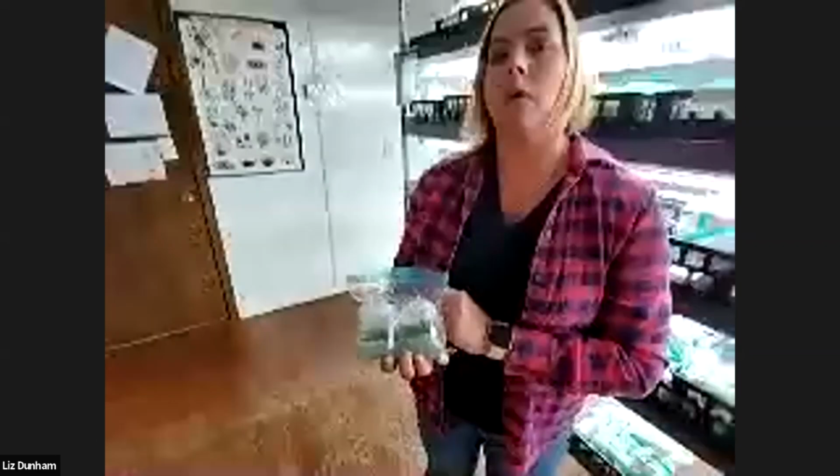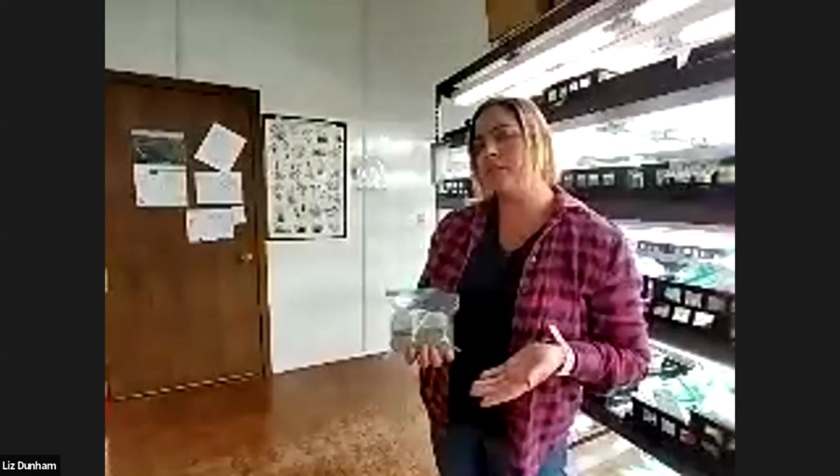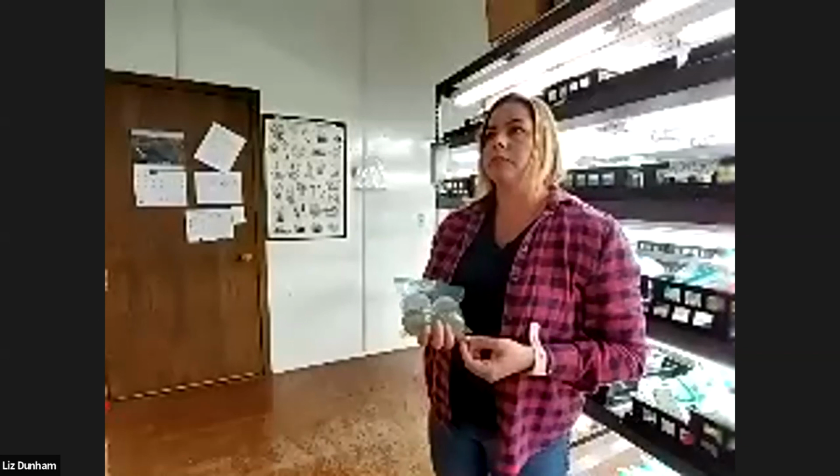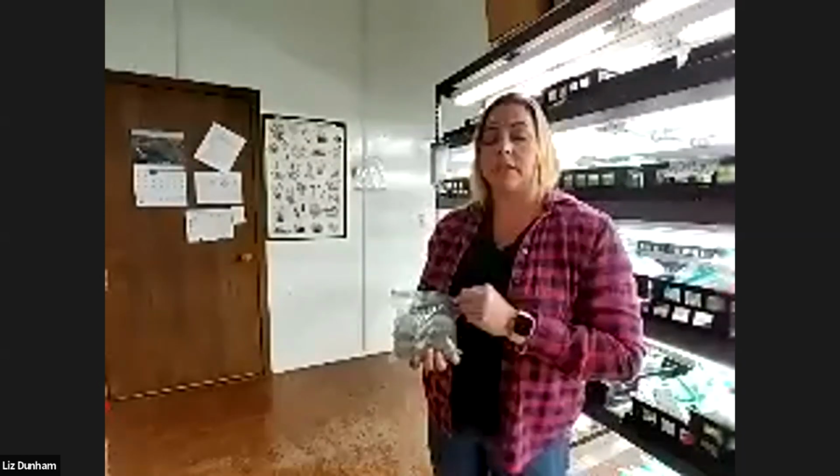This right here, this is a rose. So this is a new rose that we got in fall of last year. One of the reasons that people come to a tissue culture lab is because it is the fastest way to generate a whole bunch of the same plant. So like I said, this came in, I don't know, maybe August or September last year. It might have even been later. And we shipped out 5,000 or so to Canada for Todd Baker at Baker's Nursery last 2 weeks ago or so in plugs. And they were pretty hefty plants. I mean, they had some nice growth. They were starting to flower. So you can get a lot of the same plant quickly.